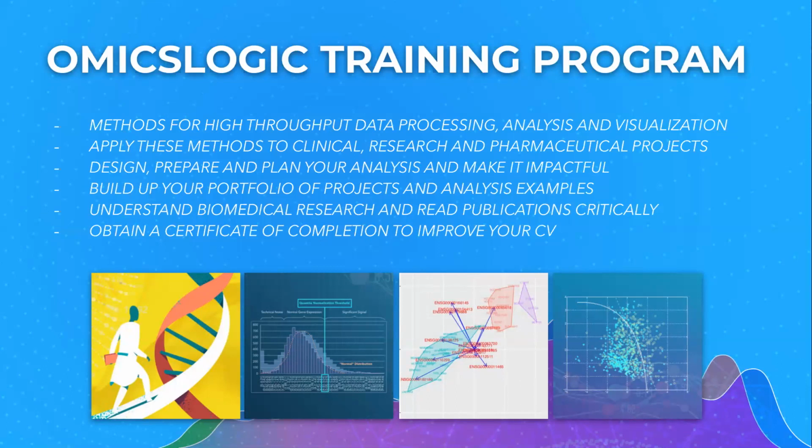But again, this is unstructured, and in this course we teach you to do the structuring of the data, the processing of the data, and definitely big data has a very important factor, which is visualization. Because until and unless you visualize something in front of you in a good way, you would not be able to understand where your data falls, what class your data falls into. So you have a biological hypothesis to prove, and whether it really makes sense or not, if you visualize the data, that would be the best thing to do at your end.